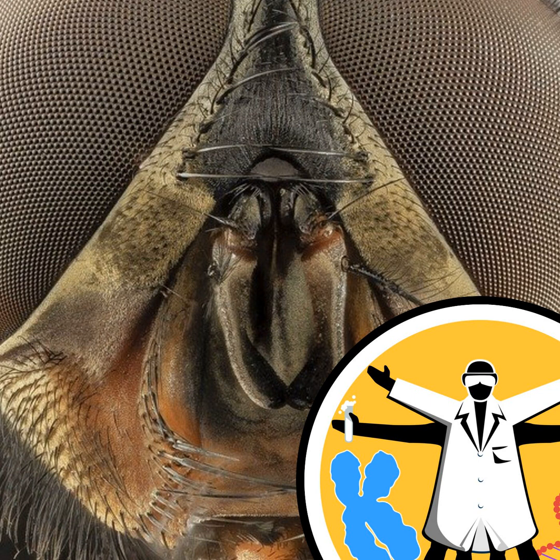One thing is how are we going to detect the bacteria against the host? What most people will do is they'll smear the flies all over some agar plates and grow the bacteria. The problem with that is this sort of culture can introduce a bias whereby only certain types of bacteria will grow on certain growth media. And actually there's a smarter method we can use now with sequencing.